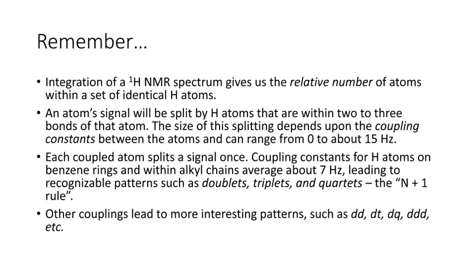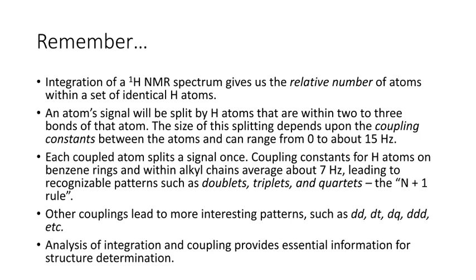Other couplings lead to more interesting patterns, such as doublet-doublet, double-triplet, double-quartet, and ultimately we lose track and we just call them multiplets. Finally, analysis of integration and coupling provides essential information for structure determination. All right, I hope that was helpful, and I hope you've got it.